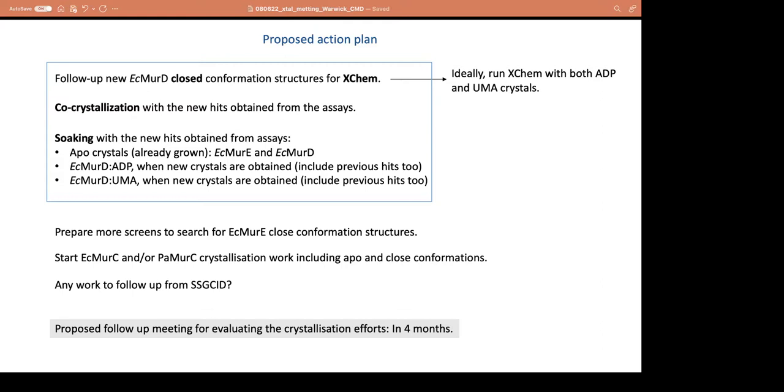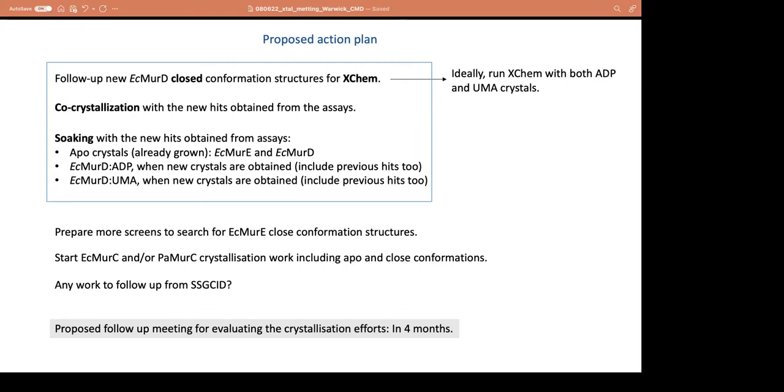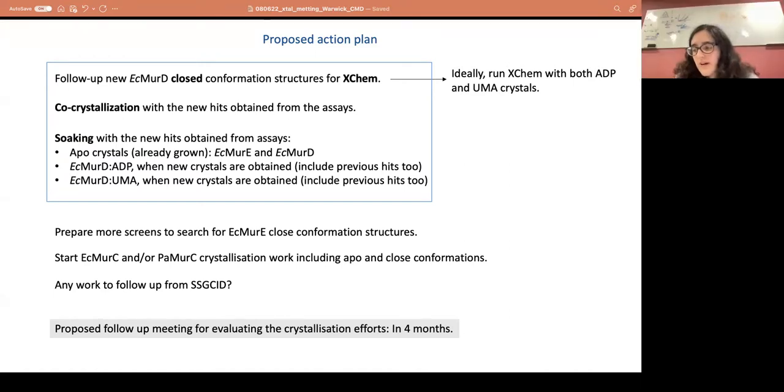And so I know, Laura, I know what you said. You're going to try those. So that's great. Thank you. That's fine. Yeah, I'll try, that'll serve the project. Right now we have 5 nice inhibitors, 4 or 5. So as soon as I have 4 or 5 crystals, I'm going to be soaking into them and see what happens. Okay.